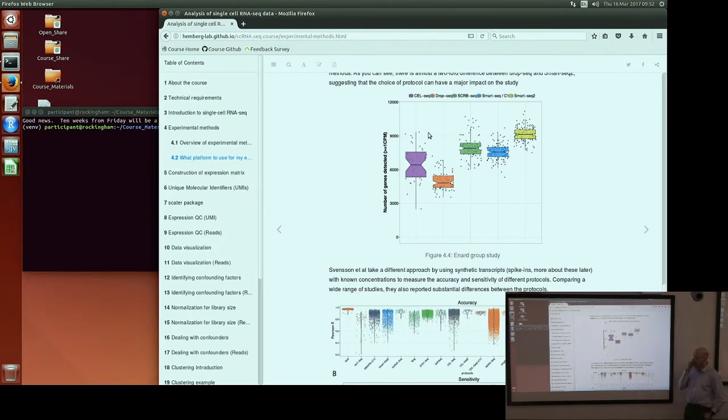And moreover, as I mentioned, there's currently a large amount of protocol development going on. So if you revisit this in about 6 months or a year, it is very likely that there will be a new set of protocols that everyone will be talking about as being the best and most useful one. So that part hasn't really plateaued out yet.